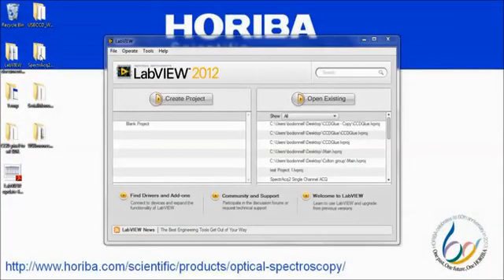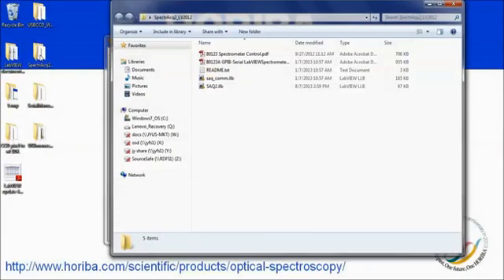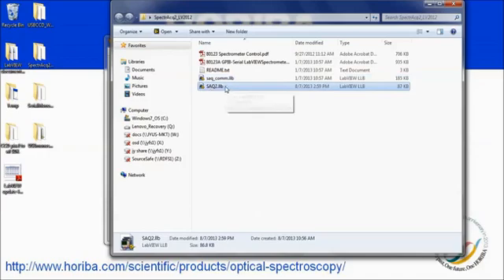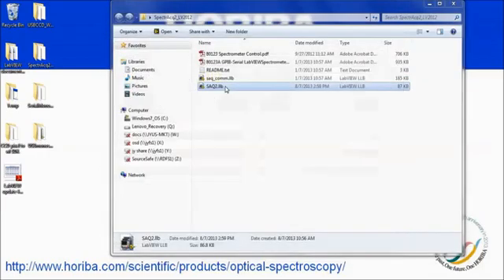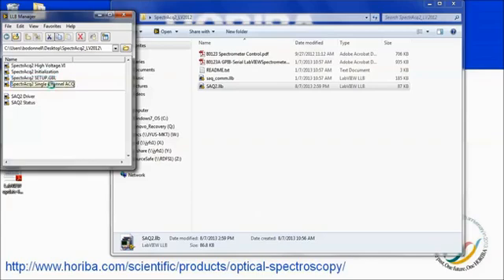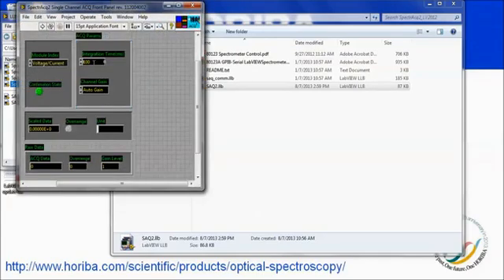Finally, the SPECTRAC-2, which is used to acquire data from single-channel detectors, also has a set of libraries. The library labeled COM controls communication through the serial or GPIB port. The library entitled SAQ-2 contains all of the sub-VIs needed to interface with a SPECTRAC-2, including setting the high voltage, initializing, and acquiring data. As was the case with the serial spectrometers, the communication parameters are stored in the setup global file. The demo program entitled single channel ACQ allows the user to set an integration time and gain, as well as obtain results as raw data or with the scaling factor included.